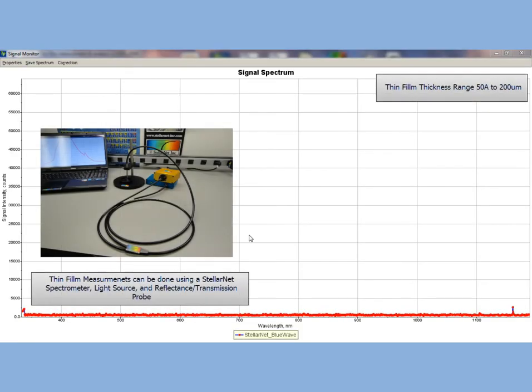We will be using a StellarNet Blue Wave spectrometer, tungsten halogen lamp, and reflectance probe.